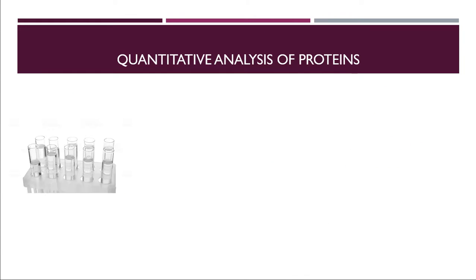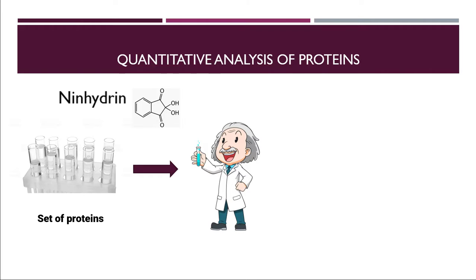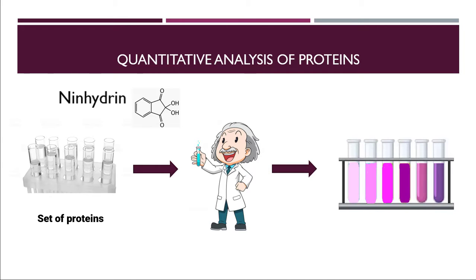Now we'll take these test tubes and then we'll put a solution called ninhydrin reagent and then we'll wait for these test tubes to change their color. When the color is changed, you can see different shades of purple color there.